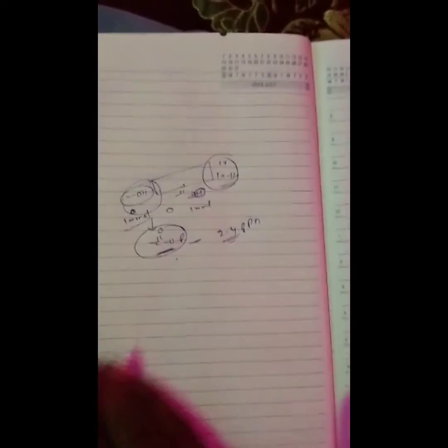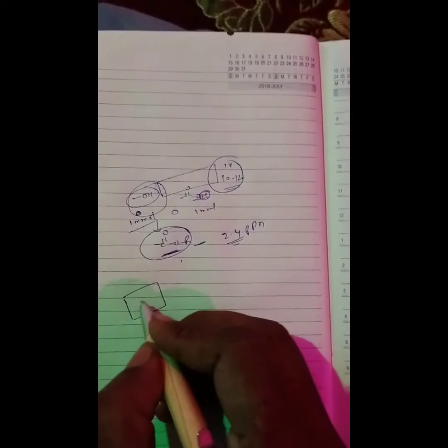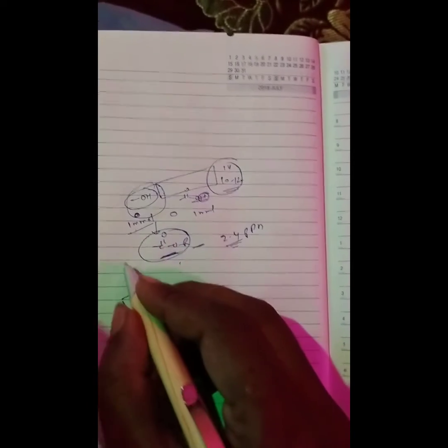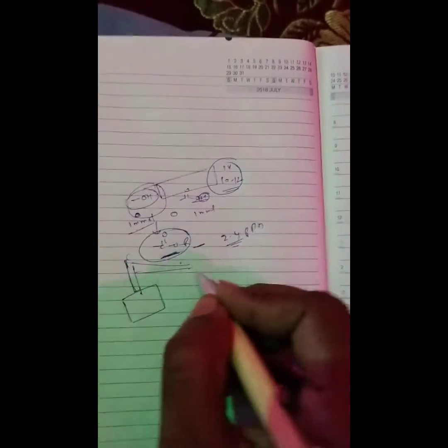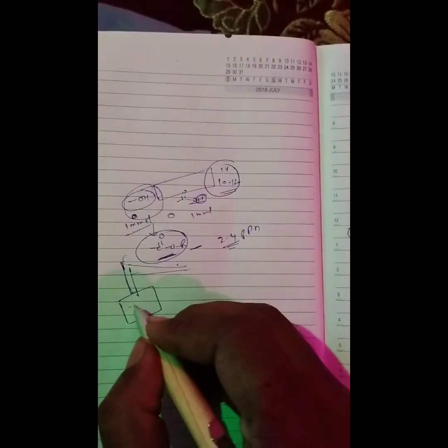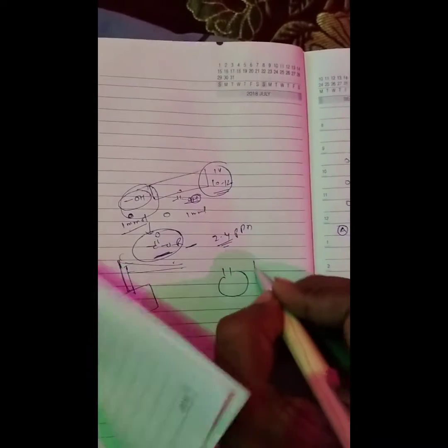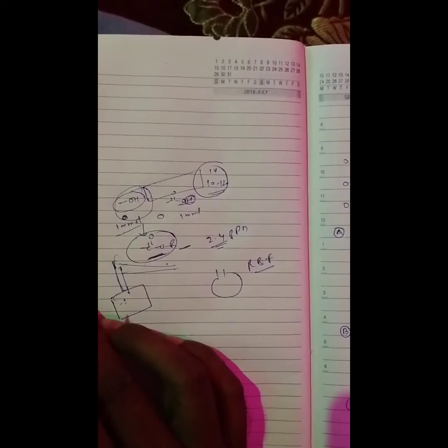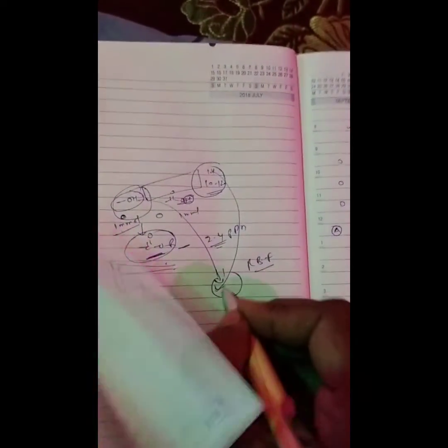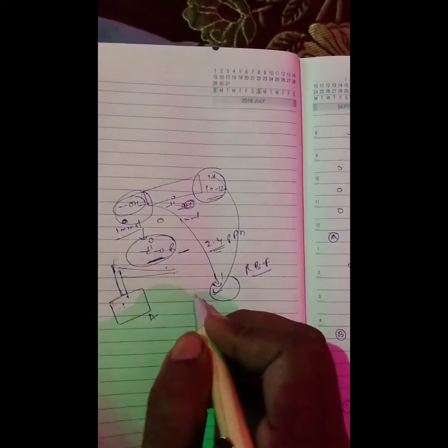Mostly the synthesis occurs by esterification, which means a hot plate is used, and first of all you will use the condenser like that. A round bottom flask is used for the synthesis of any organic molecules. You can use it according to the literature, which tells how much time will be taken. So you will check.